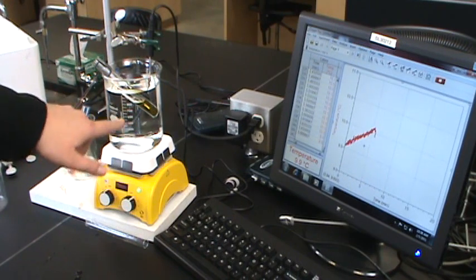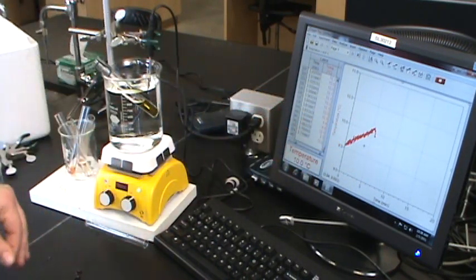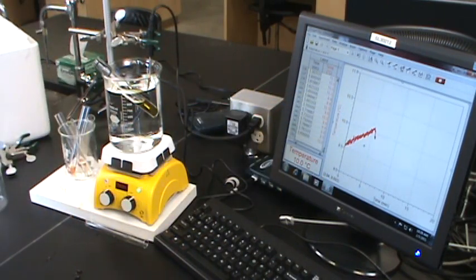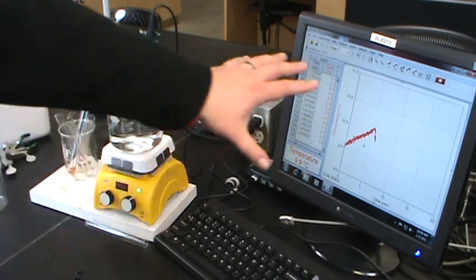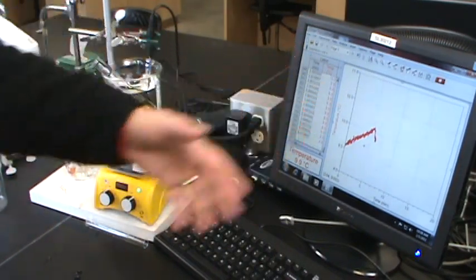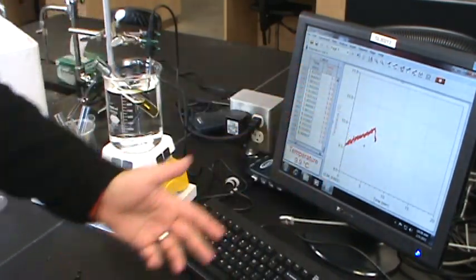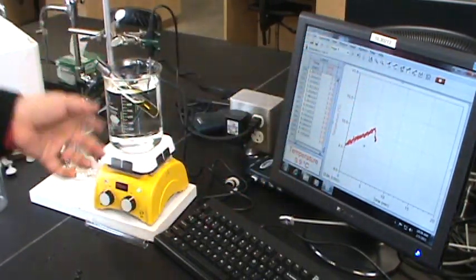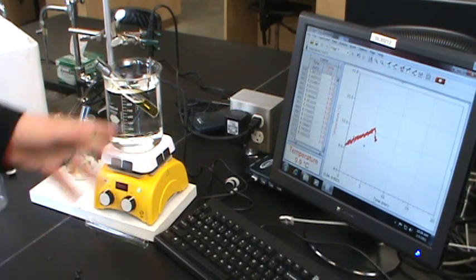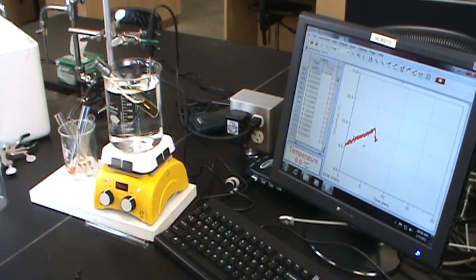So you see I still have some solid ice floating in there, and I might have gone too far because the temperature is really diving down. So it's at 9.9, closer to 10. It looks like I was okay. So again, the only real purpose of this graph is to give us something to look at that's easy to quickly glance over at, and if the temperature has gotten too high, throw in a chip or two of ice and watch the experiment as it goes. So this is going to react until the color's all gone, and then we'll be able to start another run.